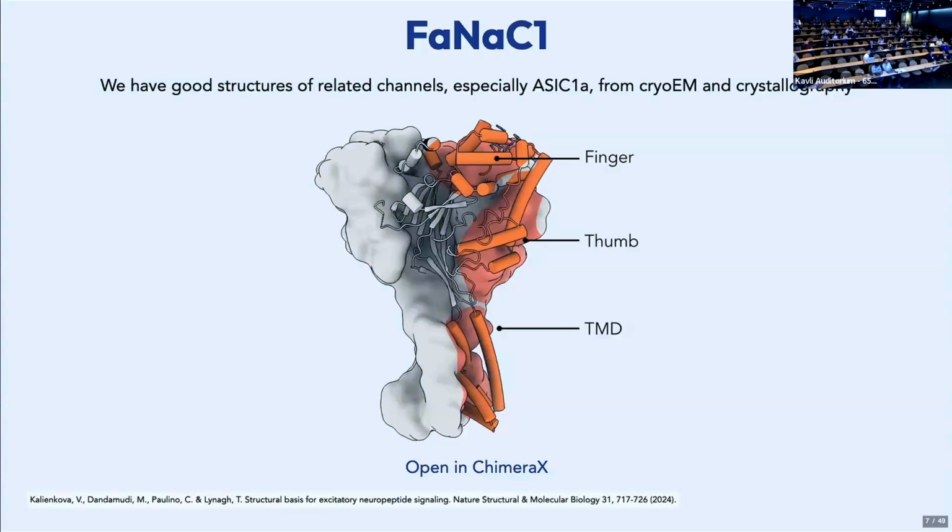So we will talk about some techniques today that are more focused on that kind of continuous deformation. Things like 3D classification are like yes, no, A, B. In the next case study, we'll talk about 3D variability analysis and 3D Flex, which are more about thinking of these continuous deformations that happen.